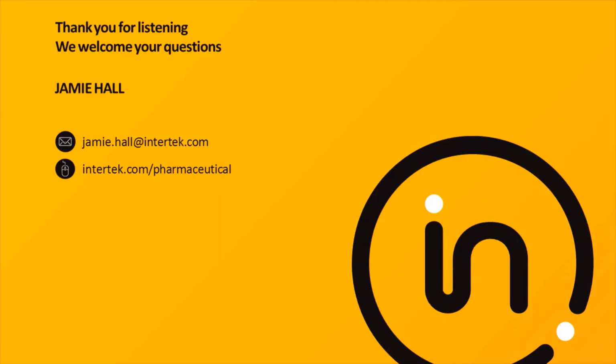Thank you, Jamie. So our first question is, what would be the typical turnaround time for flow cytometry validation? So if we're working with a fully developed method, a validation would typically take 4 to 6 weeks, and this includes the preparation of validation plan, the analysis, and the report.